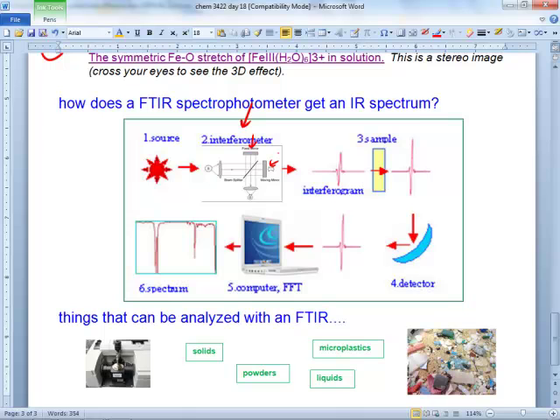You get all these lines, right? And they're going to change their spacing depending on where you have the mirrors and things. But it's kind of fun to play around with. But you could actually, if you really zoom up on it, and someone closes the door upstairs, you can actually see it vibrate a little bit.